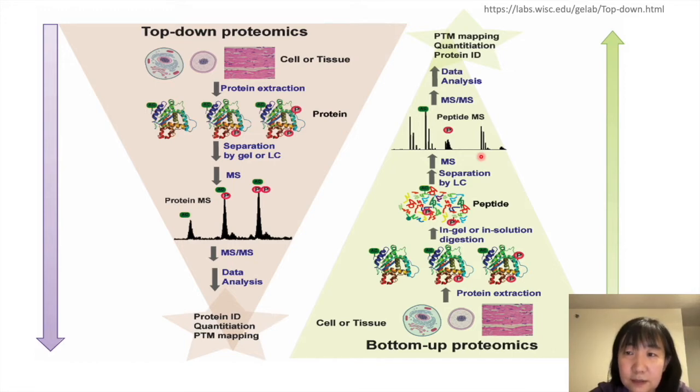It has unique advantages for the identification and localization of PTMs and sequence variations. For top-down, protein identification in a real sense can be achieved through the mass of the complete protein and its fragmentation spectrum information, and its sequence coverage can reach 100%. That is to say, top-down can retain the association information between various PTMs.